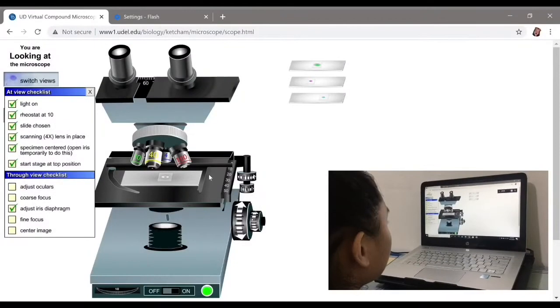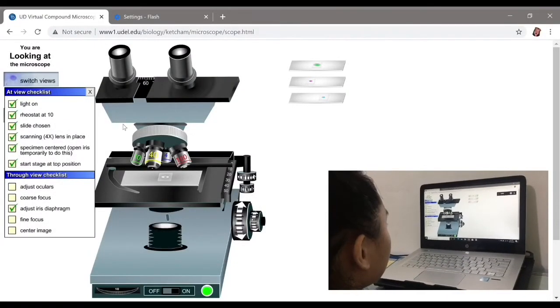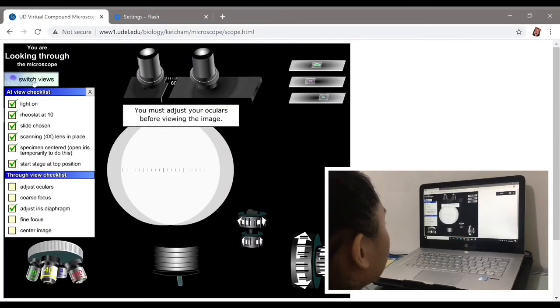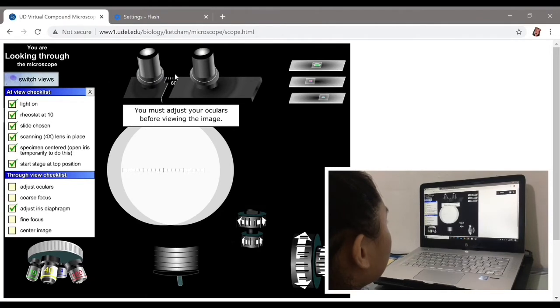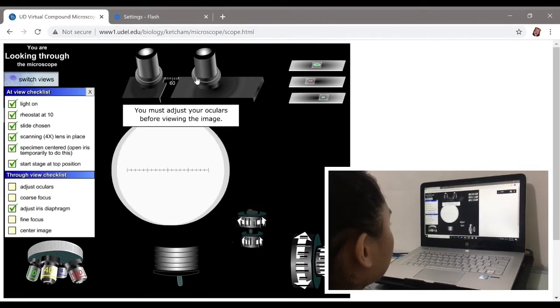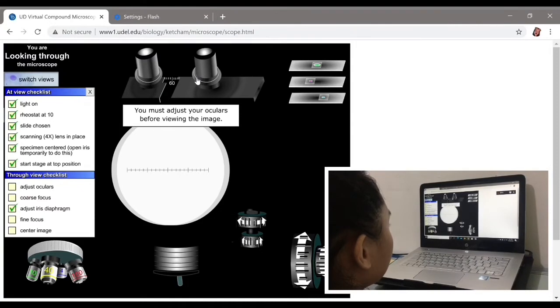After that, I switched on views to look through the microscope. Before viewing the image, I adjusted the oculars and merged it into one.